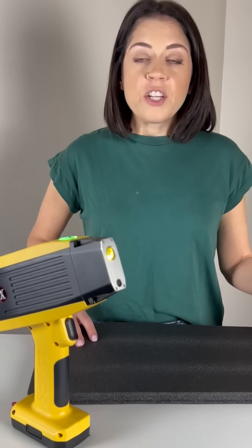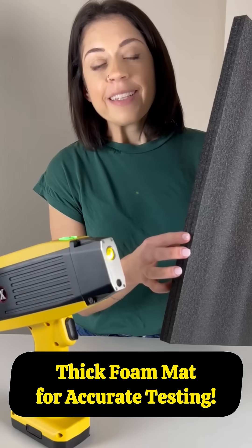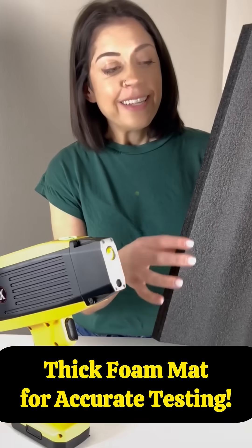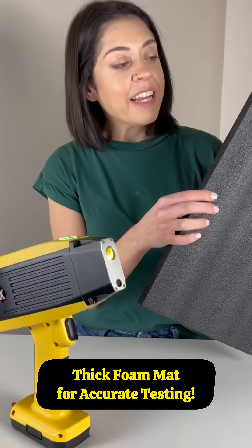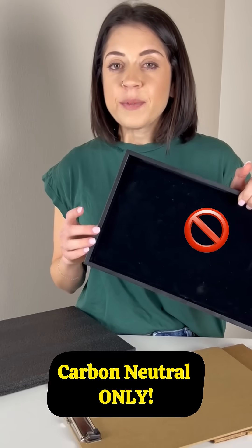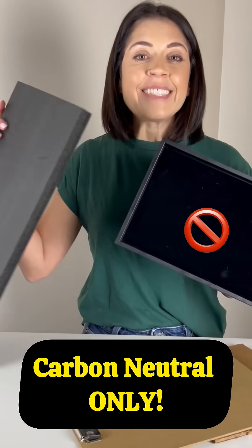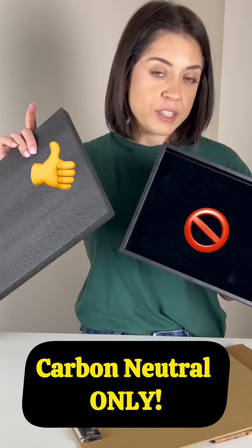To get started, you're going to need a carbon neutral surface. A thick foam mat like this is perfect. It's soft enough and the color creates contrast so you can really see what you're testing. You may have items like this at your store but these are not carbon neutral. Stick with your thick foam mat for testing.